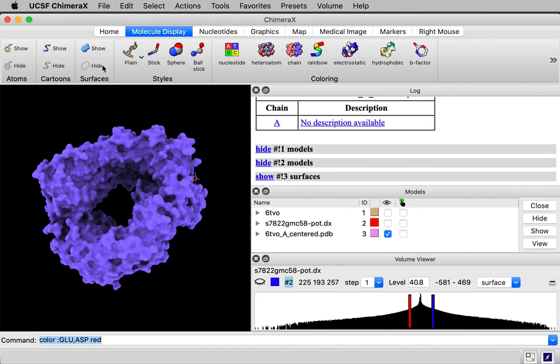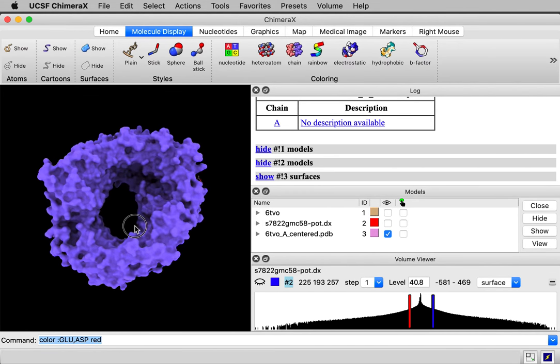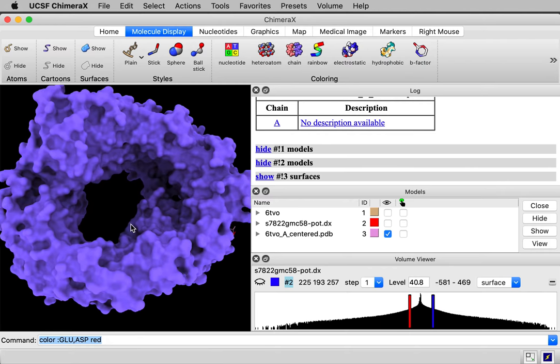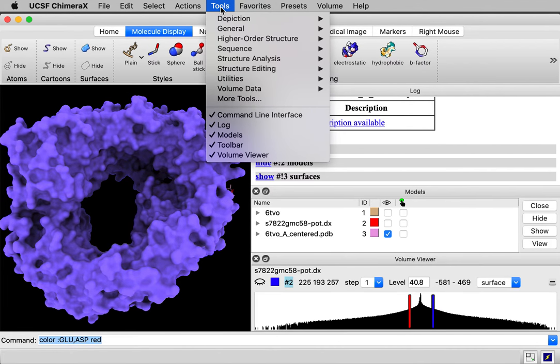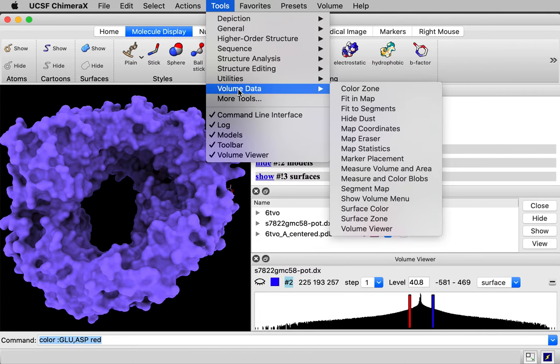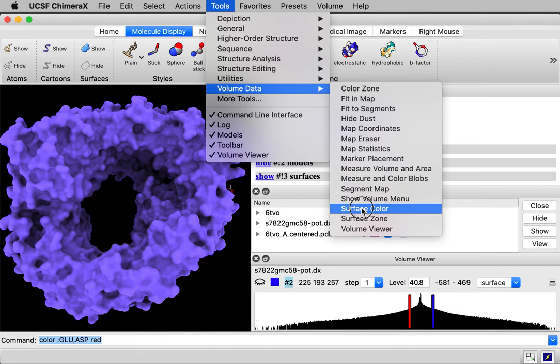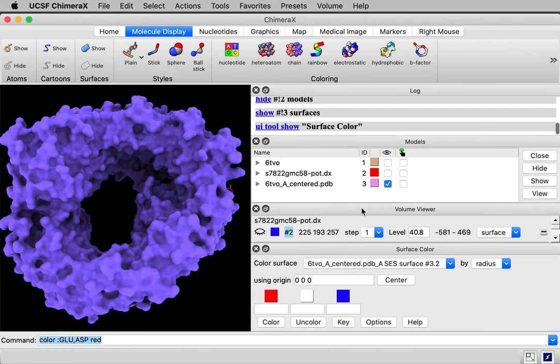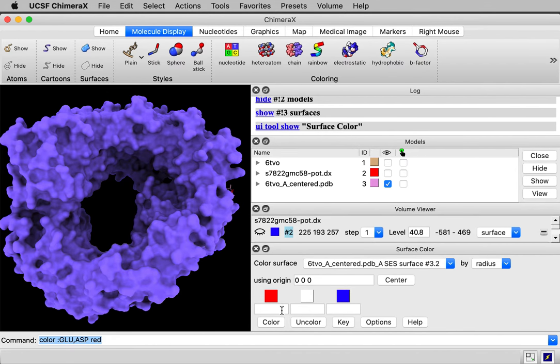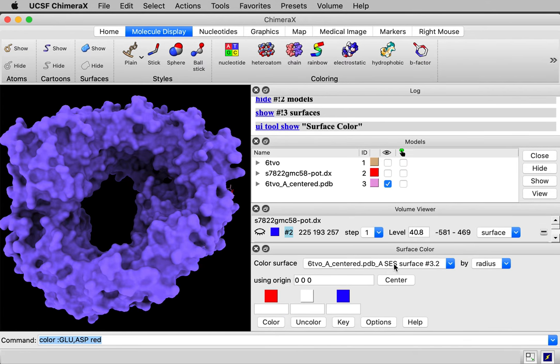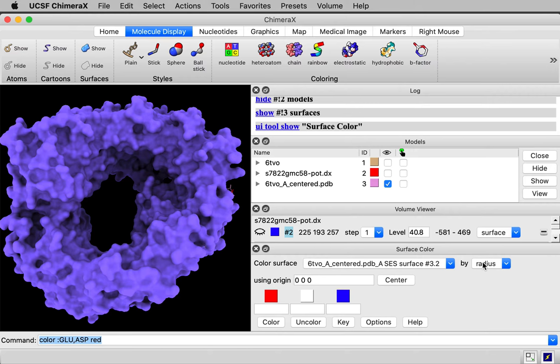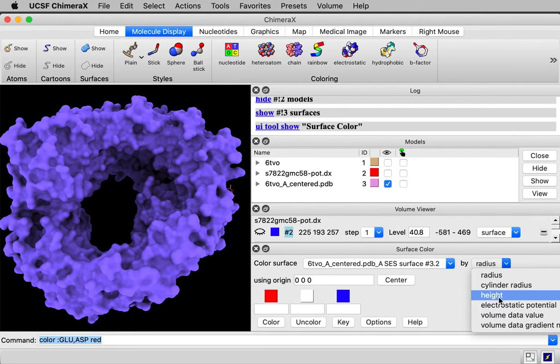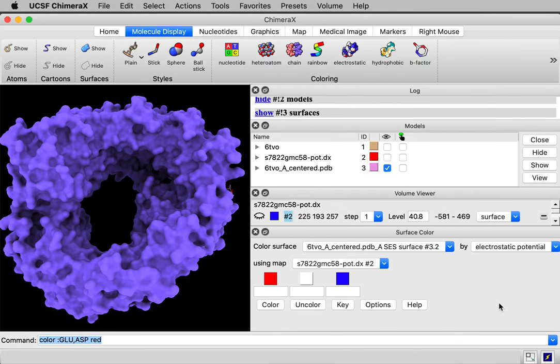How do I color this using the potential? Well, there's a tool. It's under tools, volume data, surface color. This was added in March of 2021, just a month ago. And so if you have an older ChimeraX, like 1.1, it won't have that. So you need to get a newer one. And it brought this panel up, surface color panel.